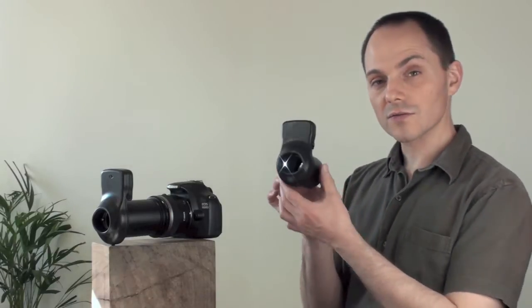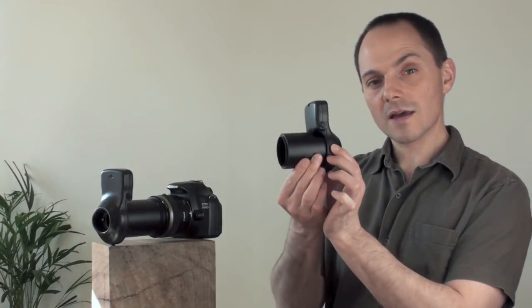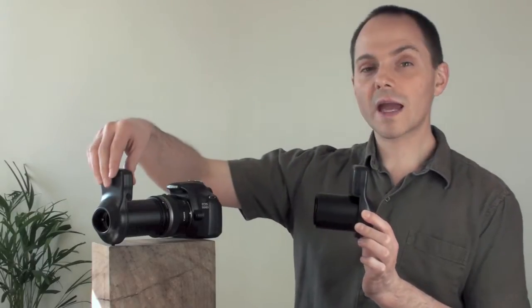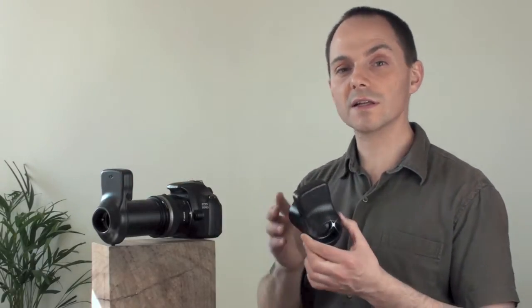Hi, this is an introduction to the Iris Explorer lighting ring. So this is it here, and it can be attached on a camera like this or on a microscope, which we'll see in another video.